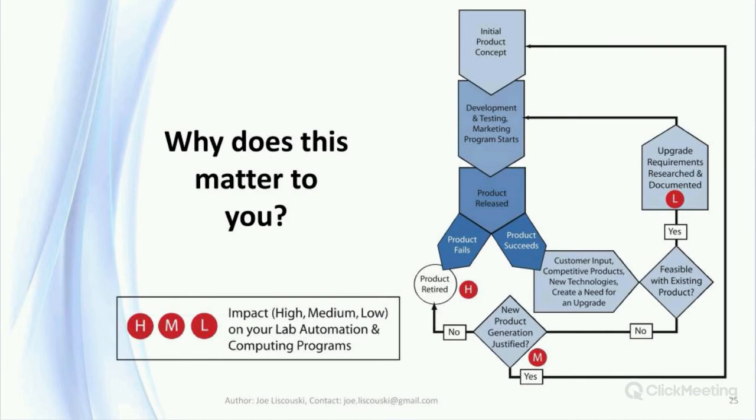You might look at this topic and say, well, we've been through product changeovers before. And that's true, but in the past, a lot of these changes have occurred when people were using the equipment and could adapt to change themselves. When you're looking at automated equipment, it's a different story. Adaptation may mean reprogramming the entire system.